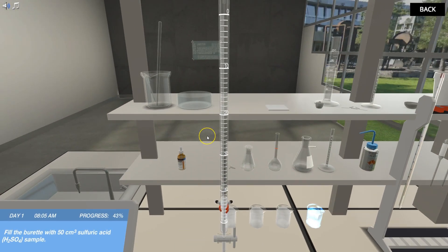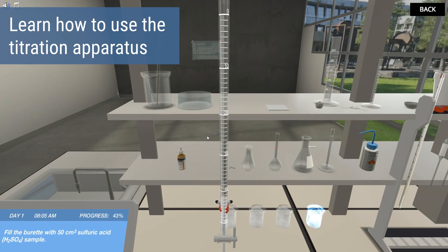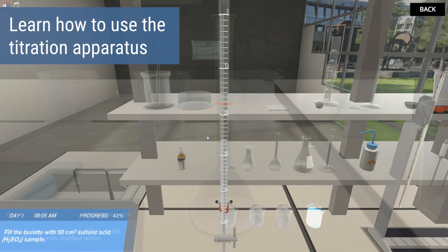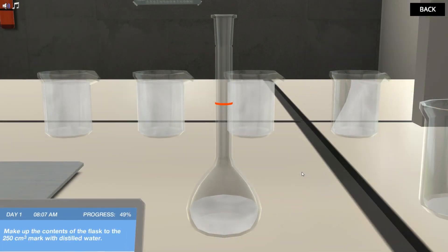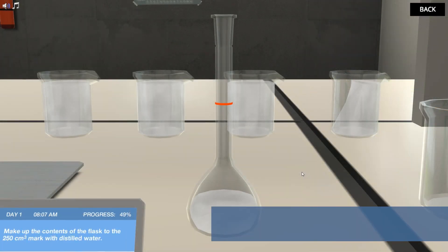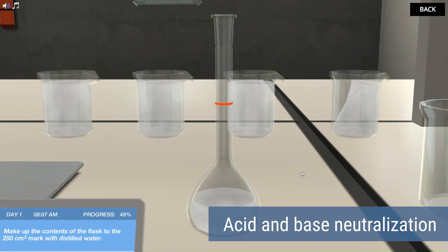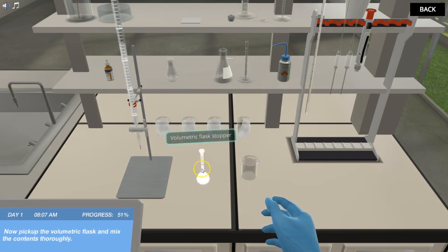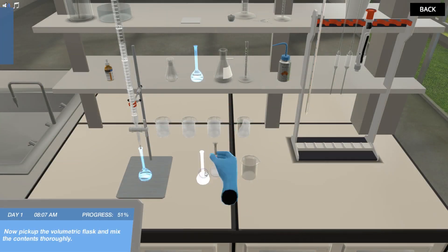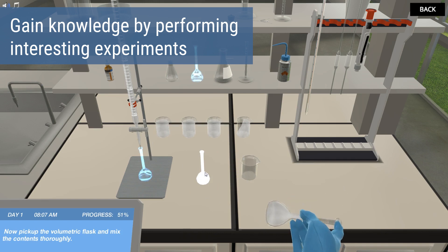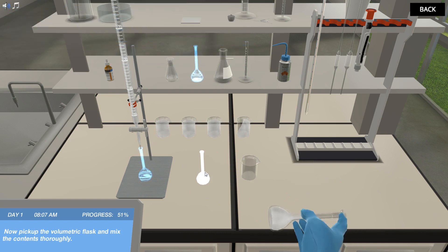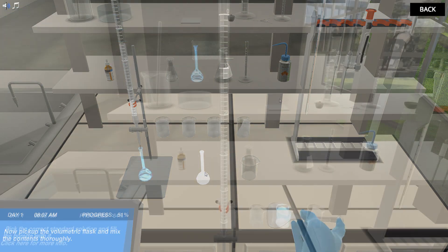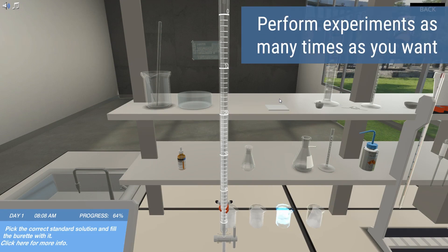The mission begins by getting accustomed with the basic titration apparatus. Then, you will learn about the basic chemistry of acid and base neutralization before performing the titration and analyzing the results. You will perform interesting experiments to figure out the unknown concentration of acids, and you will also have the full freedom to perform as many titration experiments as you want.